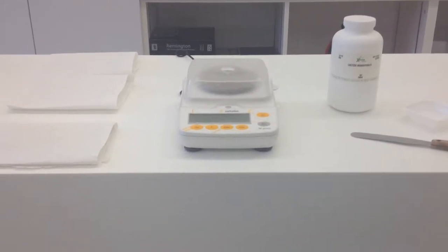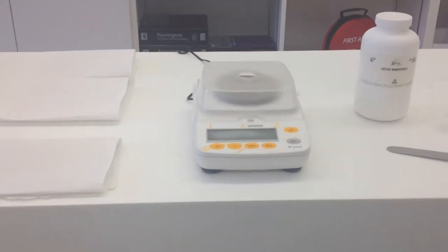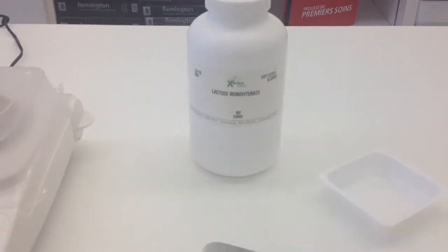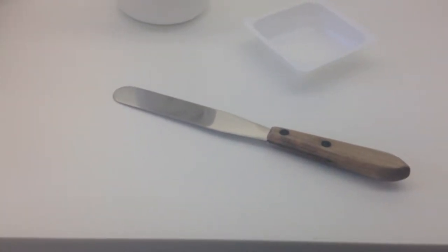Hi everybody, today we're in the compounding lab and I'm going to show you how to use an electronic balance. As you can see I've set up my work area — I have the electronic balance in the middle, I have my ingredient that I'm going to be weighing. Today I'm actually just using lactose for our demo. I have a weigh boat; you could either use a weigh boat or a weigh paper, appropriate to the size that you're weighing, and I also have out a spatula.